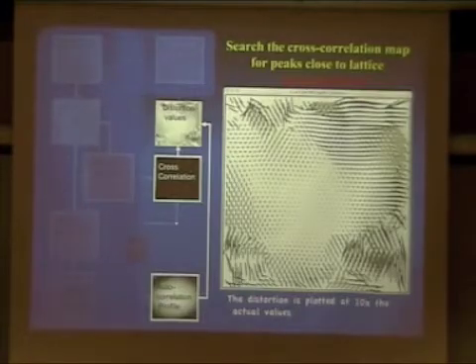Or if we do spot scanning, then there is no guarantee that one spot and the other spot are exactly in register, because between the two spot exposures you may have a small drift. So these are the little things that create headaches. Yeah, I can see those.